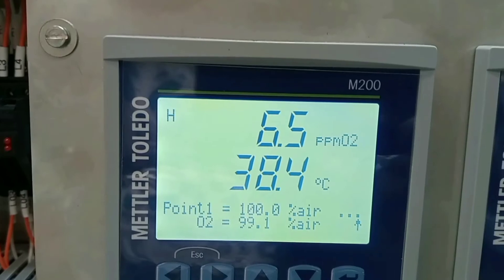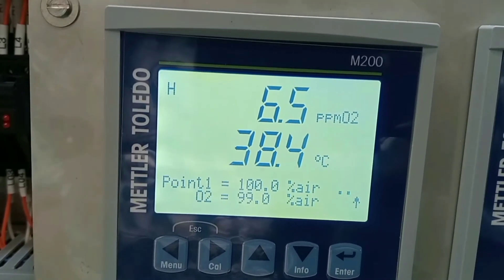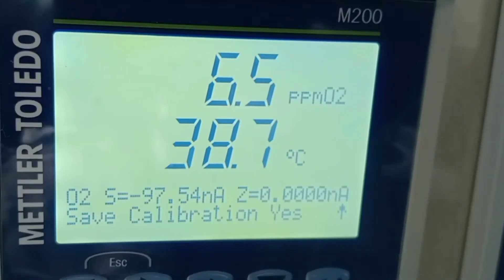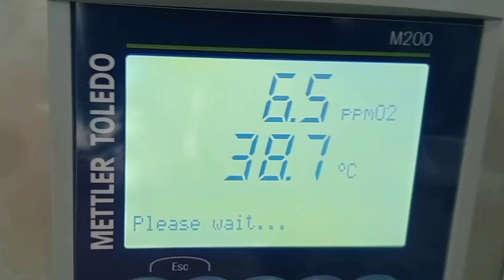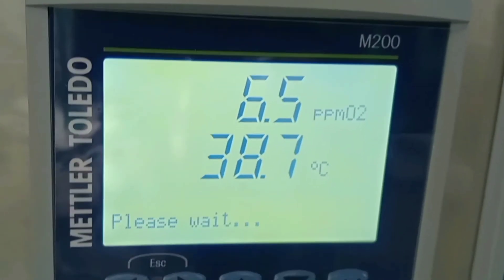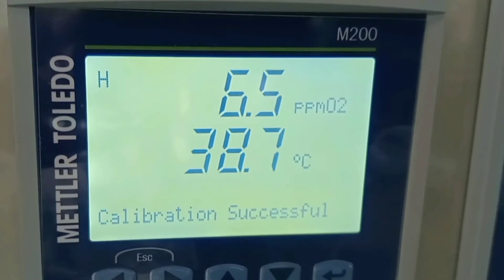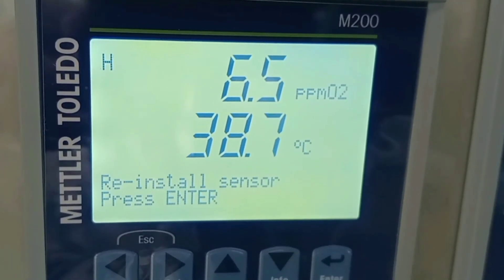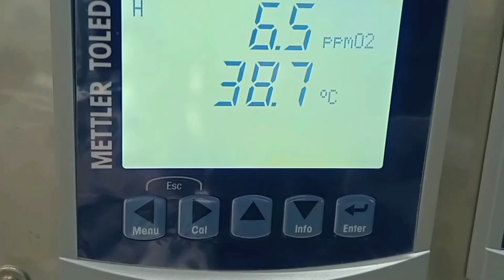Let the transmitter stabilize. After stabilization it will display the slope values. Press enter again and the transmitter shows a calibration successful popup and asks the user to reinstall the sensor. Note the reading.